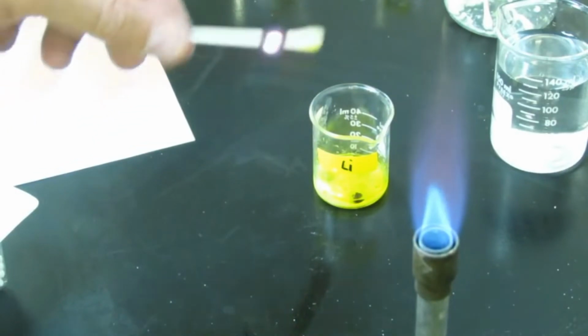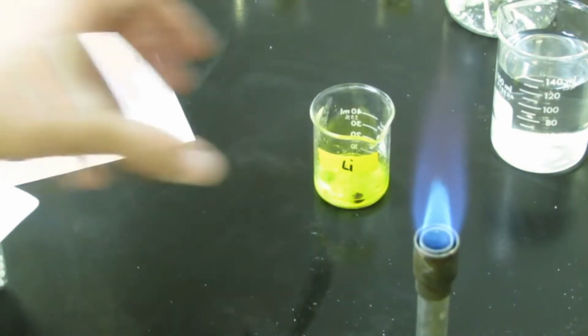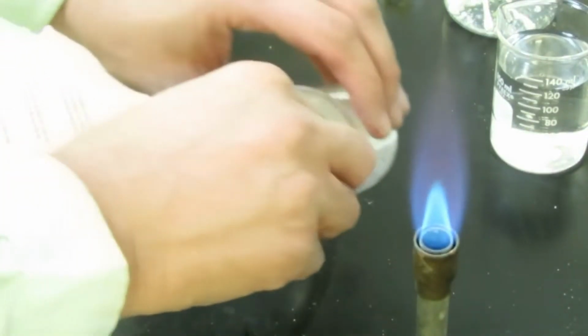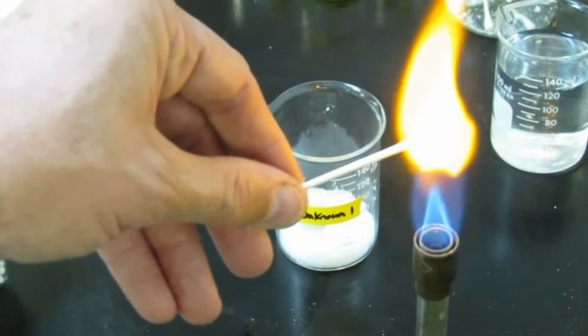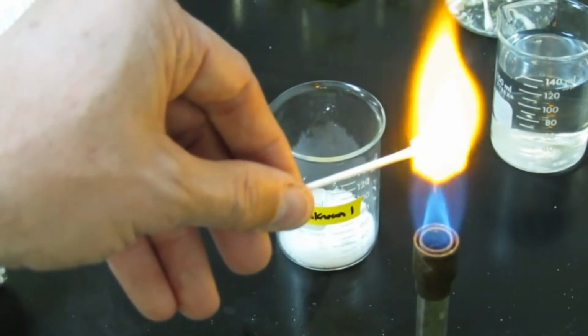Okay, put that in our waste container, and now we'll do our two unknowns. This is unknown number 1, so it's going to be one of those we just tested. There's the tip of our Q-tip, and we'll get some of the unknown salt on it. Test our unknown. It's your job to decide what that unknown is. That's unknown number 1, folks.